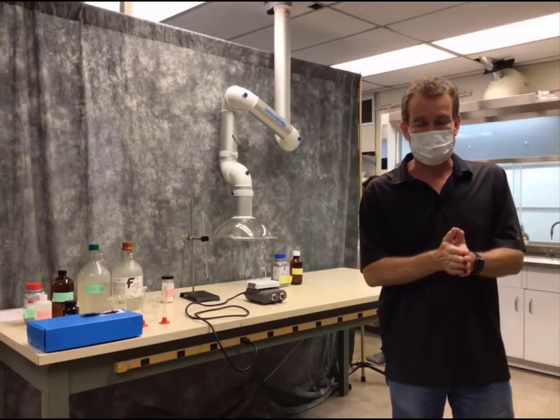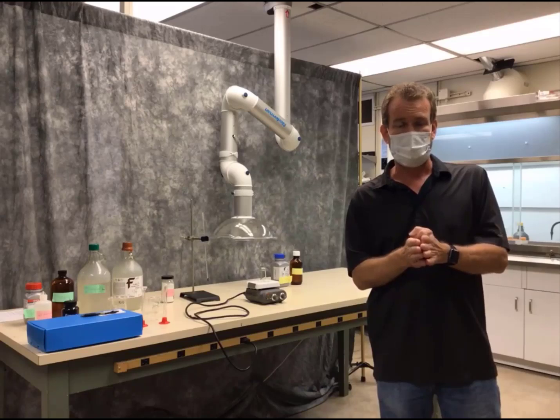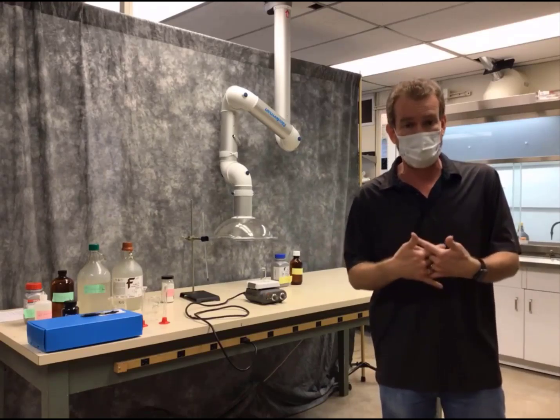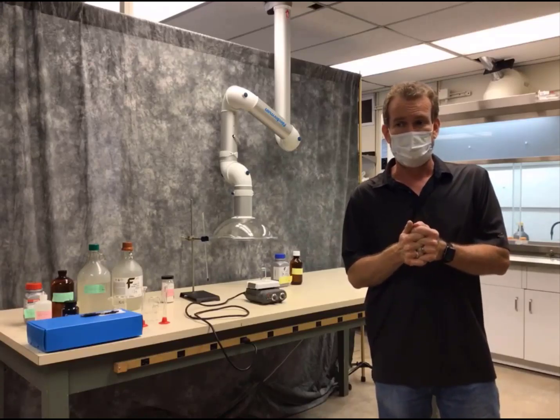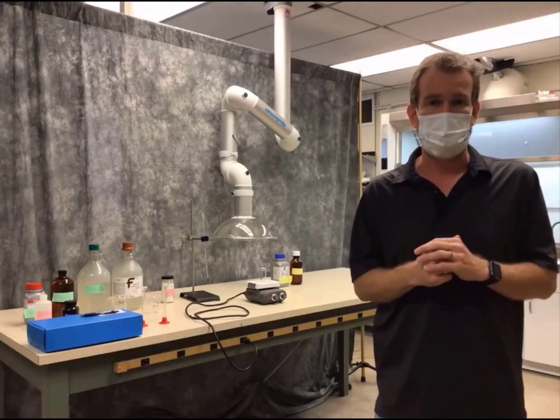All right, so what are we doing today? We're going to do a series of reaction steps to synthesize some compounds, and then we're going to take those compounds we synthesize and react them in one final reaction to produce some light. So let's talk just a little bit about the word synthesis.